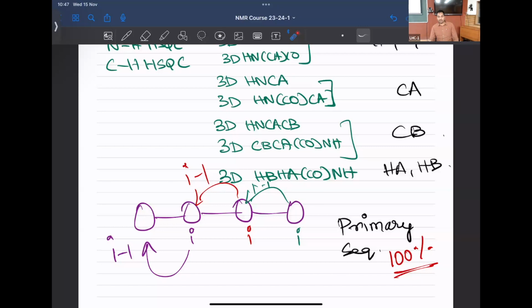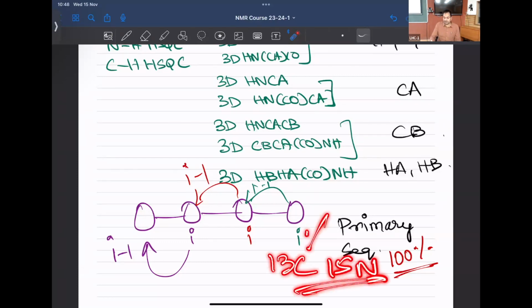The moment you know the DNA sequence, you know which codon transcribes to which mRNA translates to which amino acid. The moment you know the protein that is of interest, you go to the gene region of the protein, then you'll be able to know the protein sequence. Then generally what people do, you also have the ability to create a plasmid to code whichever protein you want. Then you take this plasmid, give it to a bacterial cell, and then feed the bacterial cell 13C and 15N enriched chemicals. For instance, we'll feed it 13C labeled glucose and 15N labeled ammonium chloride salt.